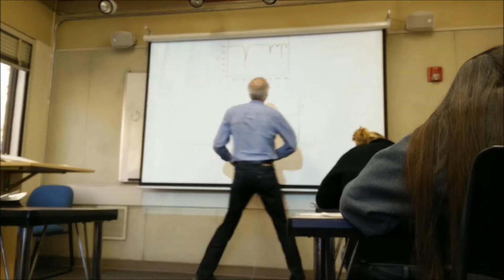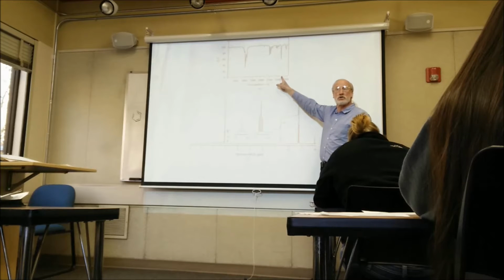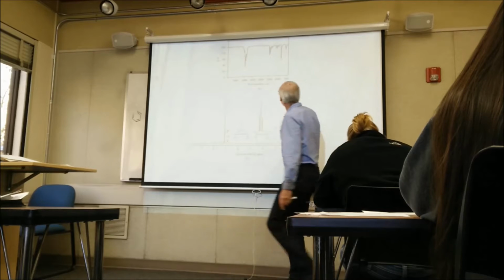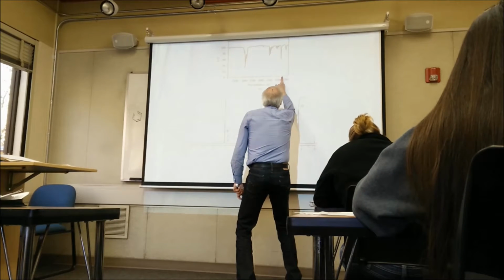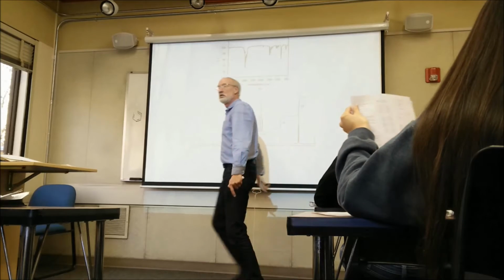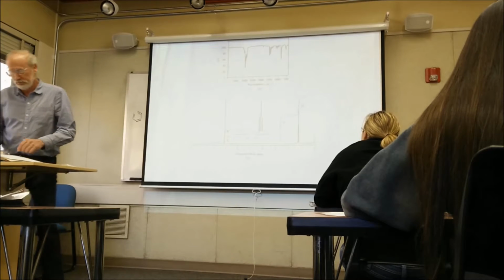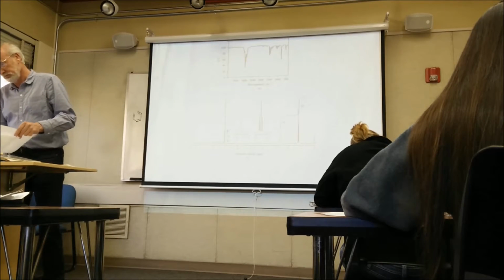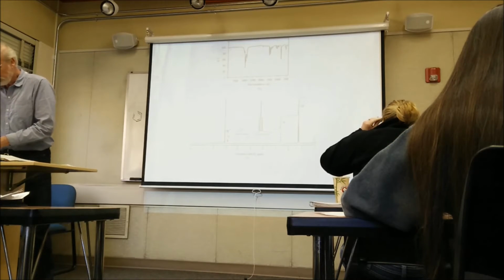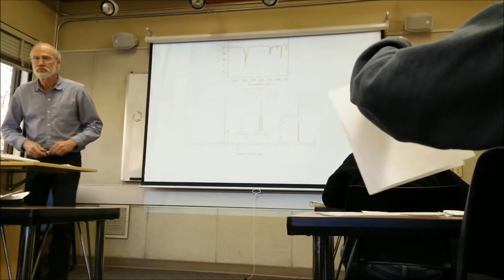I would go up here now. If I had a little bit better IR, I'd go up in here to see if I could tell whether it was ortho, meta, or para disubstituted. Well, good luck with that. That's 750 right there, so this looks like it's about maybe 800. Can I tell you anything? No, there's too many things to look at. This is 780 and 830s, just this much on either side.